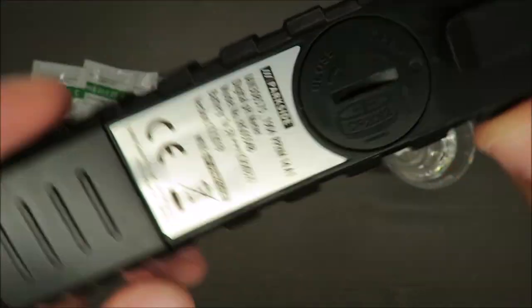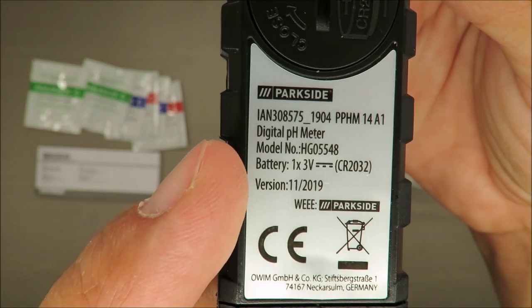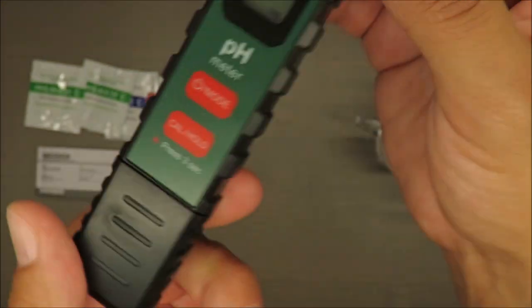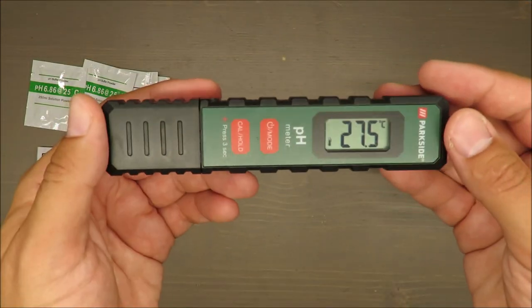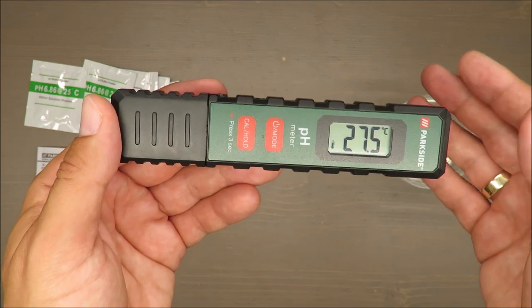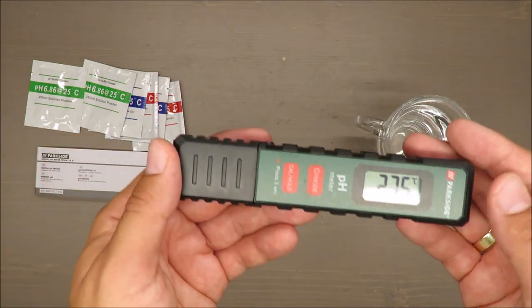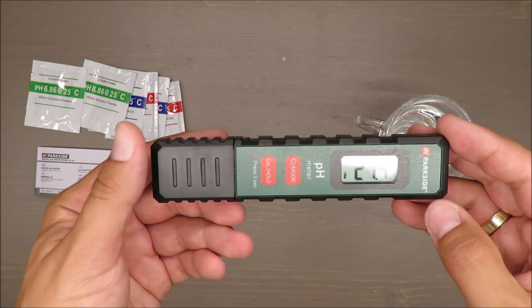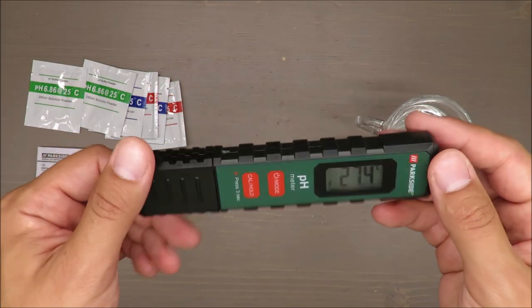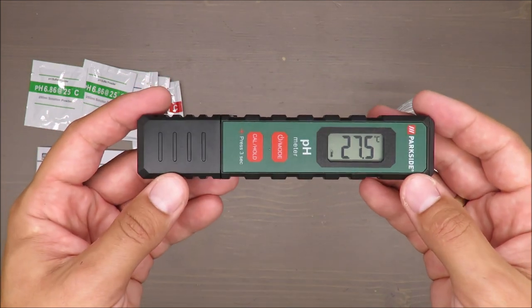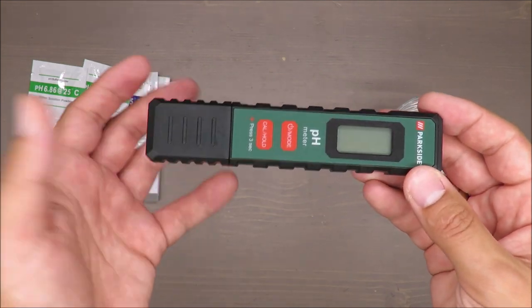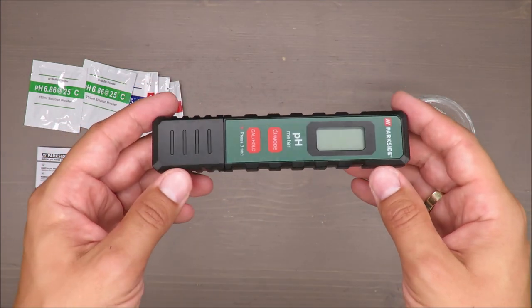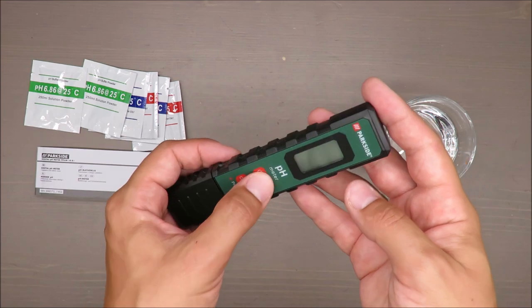What else? Basic features: measuring range is for pH from 0 to 14, so the whole range. Accuracy is 0.01 pH plus minus. Display resolution is 0.01. Temperature compensation is from 0 to 80 degrees Celsius, so you cannot check boiling water but near to it.